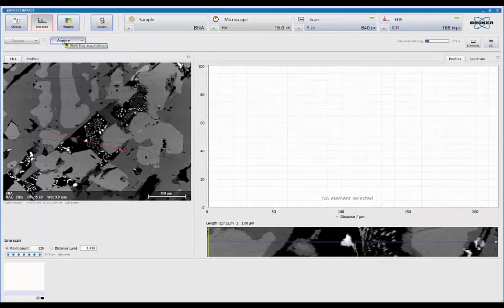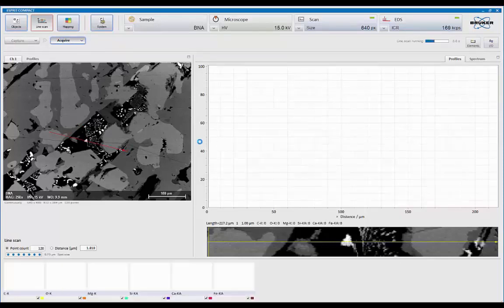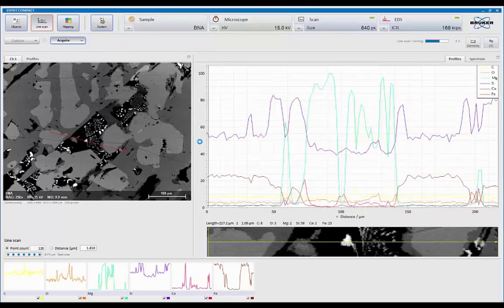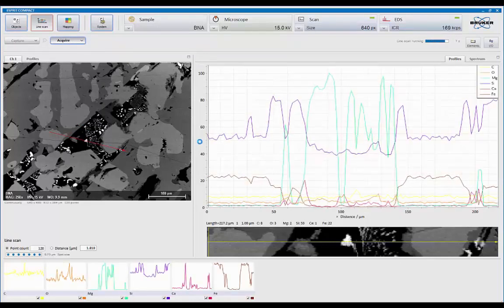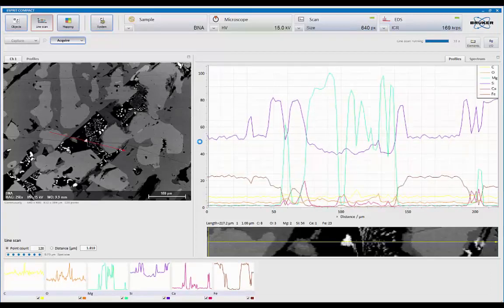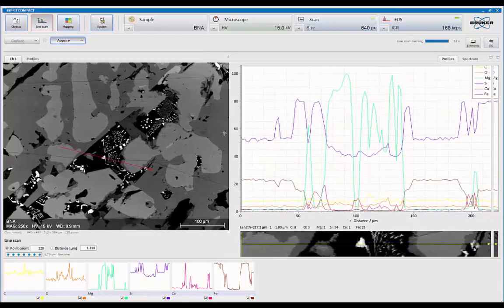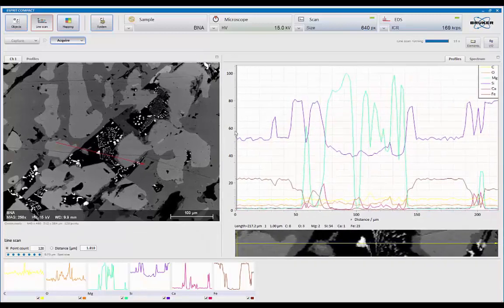Now, just like in HyperMap, I didn't tell it what elements to monitor. So it looks at the pulse stream and comes up with a list of possibilities. And again, you can adjust this at any time, just like in HyperMap. So we can add to the list throughout the analysis set.